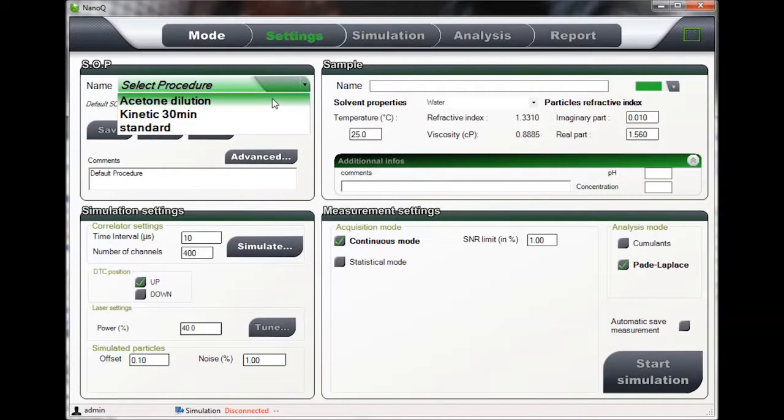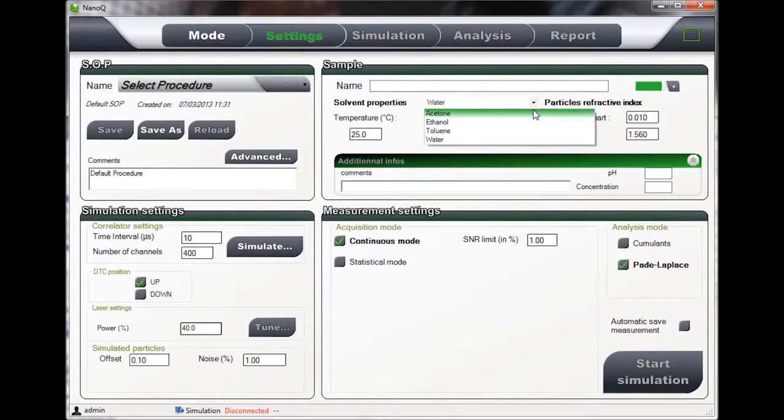Programmable standard operating protocols for routine measurements, quality control and turnkey operation for non-expert users. An exhaustive solvent database including viscosity and refractive index data and their dependence with temperature.